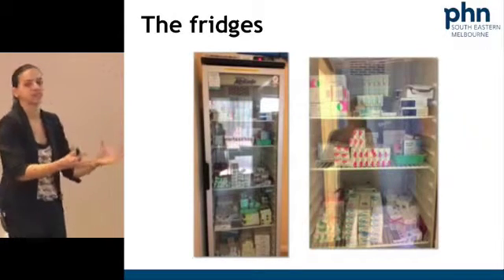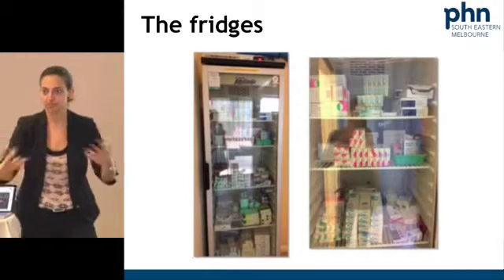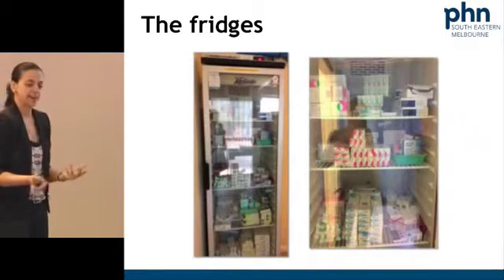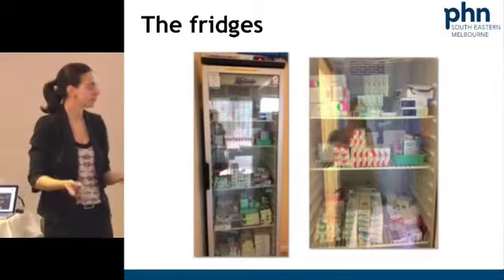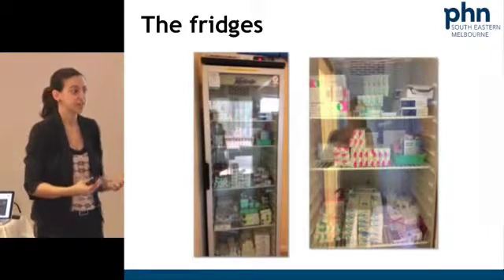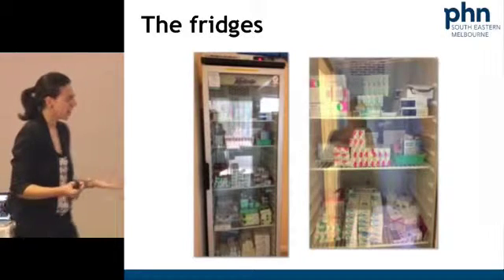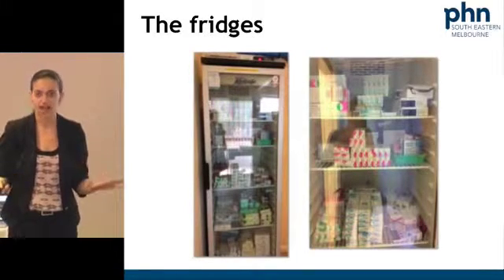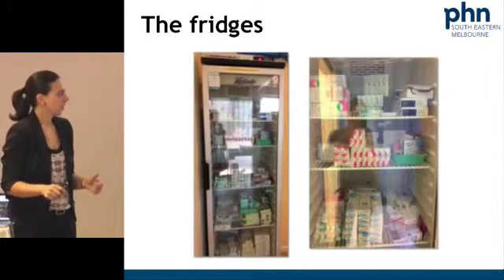And again, this is a special scenario because we had this gentleman come out and do this maintenance thing. Now, a couple of weeks later, I get another practice calling me, saying, we had a maintenance guy, the same guy that came last year, same fridge, and we've just been issued with this notice of non-compliance. So here I am thinking, well, either all these fridges are all of a sudden starting to die after 3 years, again, it was only a couple of years old, or there's something dodgy.